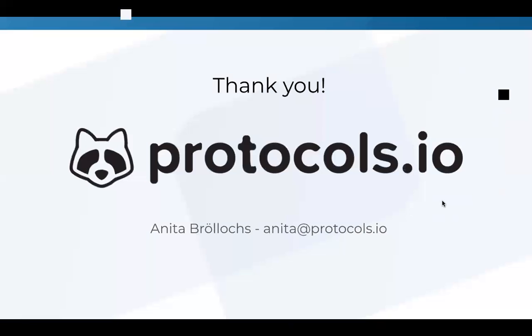And for your own private files, of course, we don't send that publicly to any mirror, but you can in bulk export all of your protocols, all of your records directly to your computer or with a click to Dropbox, to Google Drive, to Box. So we have those integrations built in. There are even a few electronic lab notebooks that have, through the API that we have, directly connected to Protocols.io.